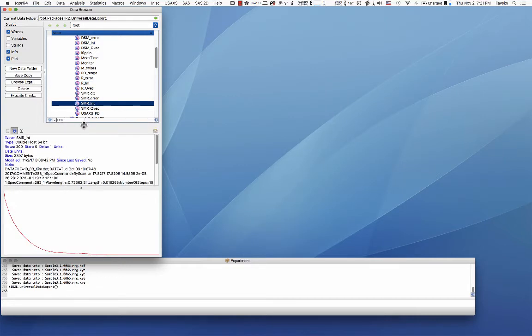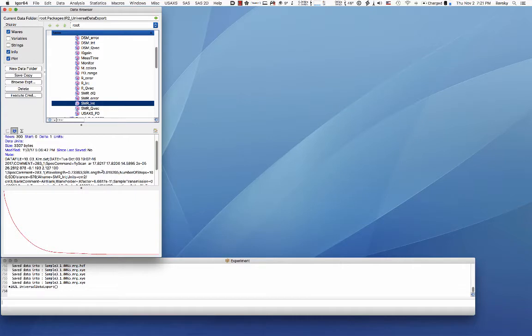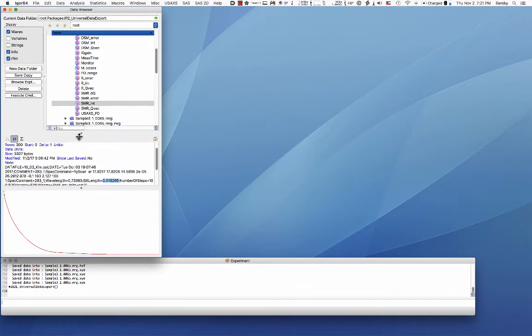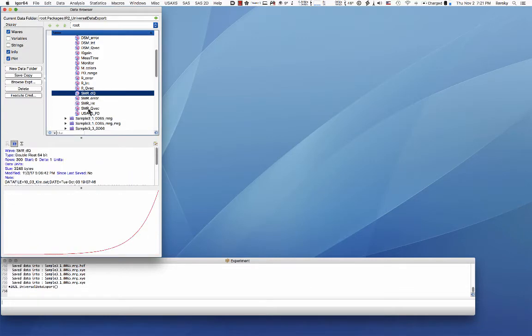Not per sample but per setup. So if you look on that there is a slit length somewhere. Here's a wavelength, there's a slit length here. So whereas a Q resolution of our instrument in the high resolution direction is 10 to minus 4 inverse angstroms, a slit length which is in the other direction is 0.02, 0.025, 0.03. Depends on wavelength mostly. So these are slit-smeared data.